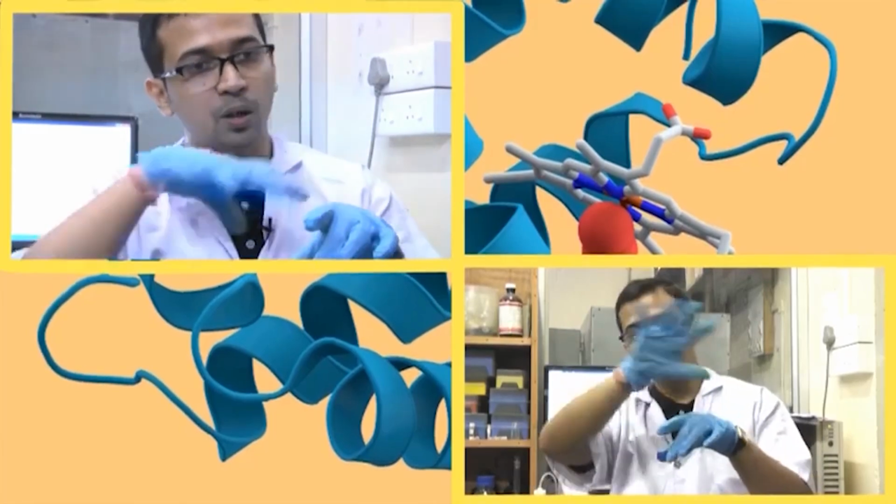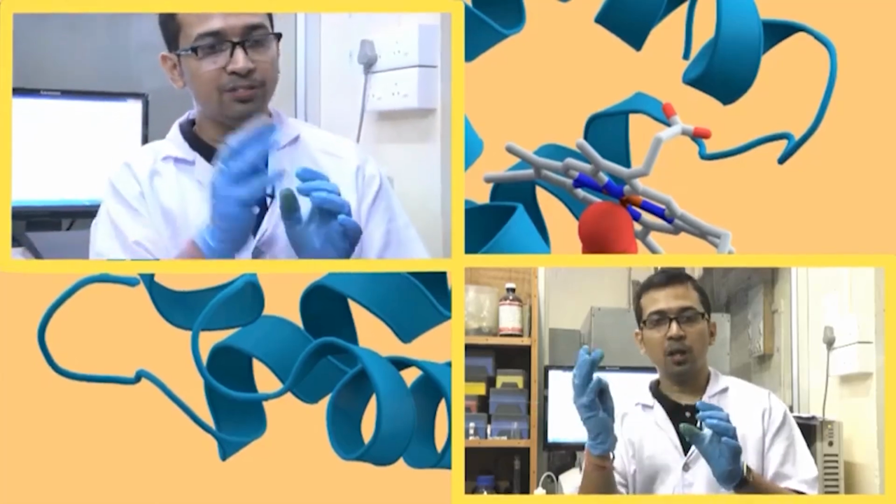Whereas in the case of curcumin, what is happening? Curcumin was not hovering in this region, it had settled down this way. But when the protein came, it rescued curcumin.